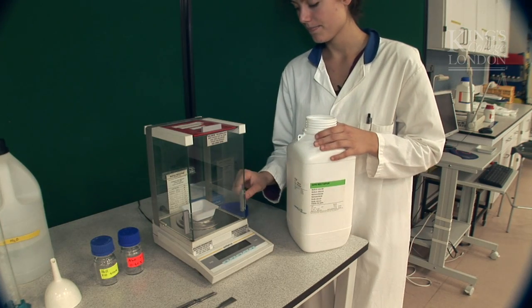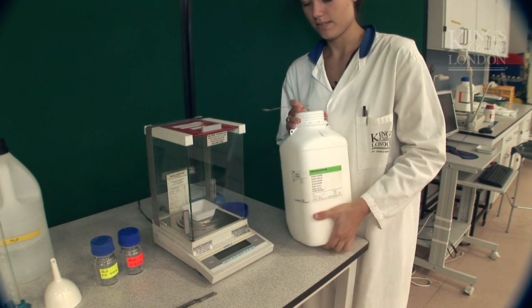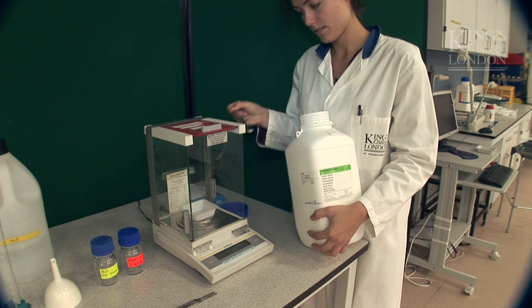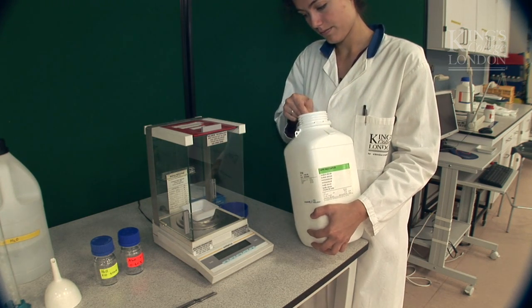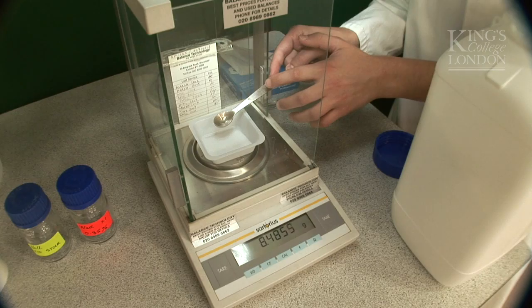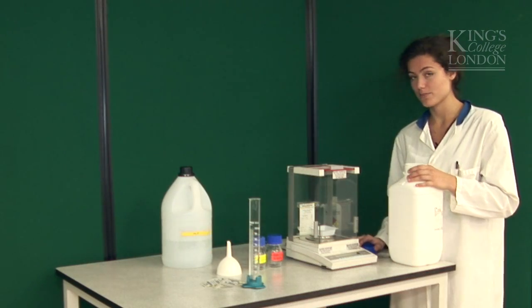Sodium chloride. There we go. So I have my 8.5 grams of sodium chloride.